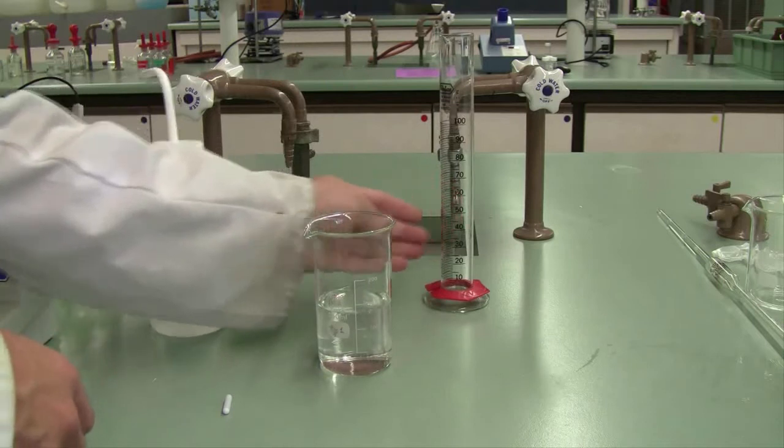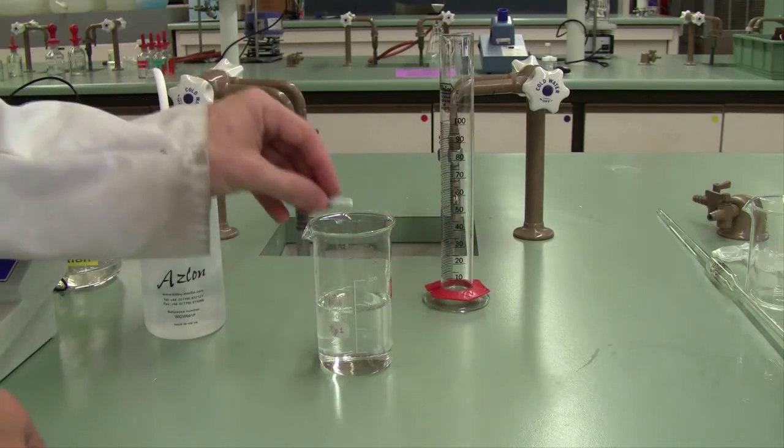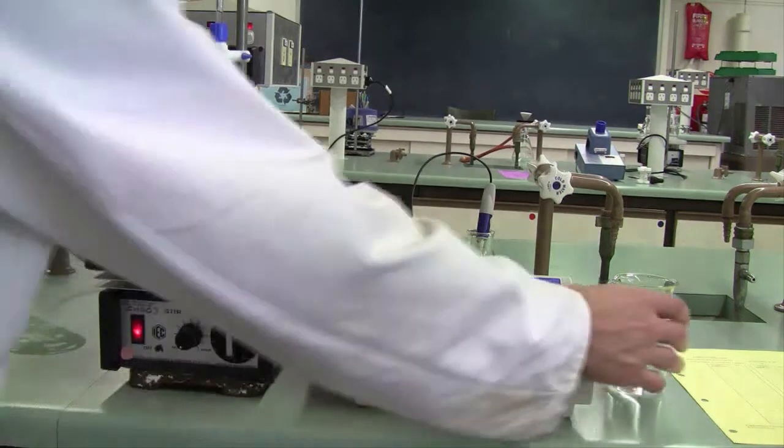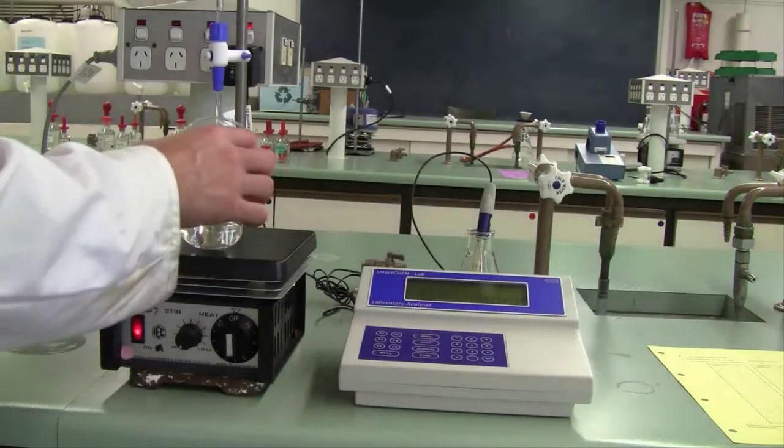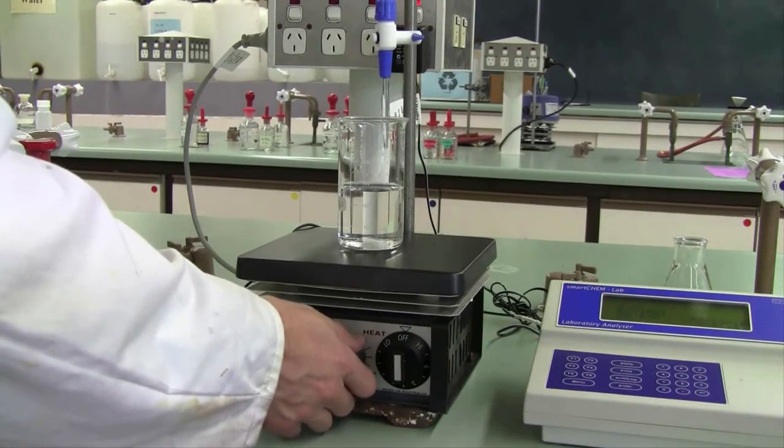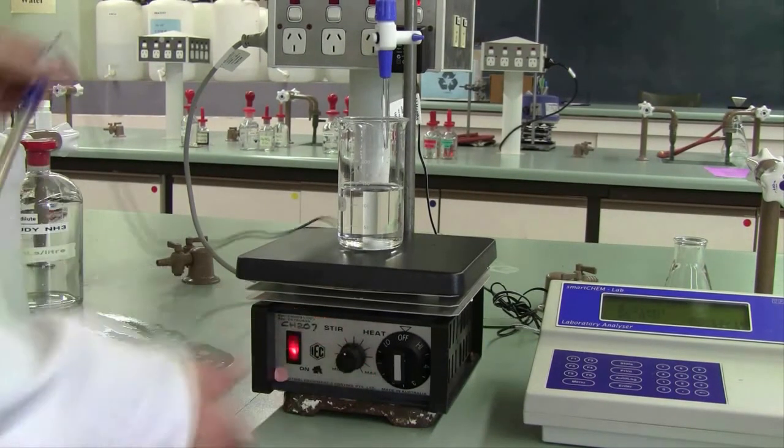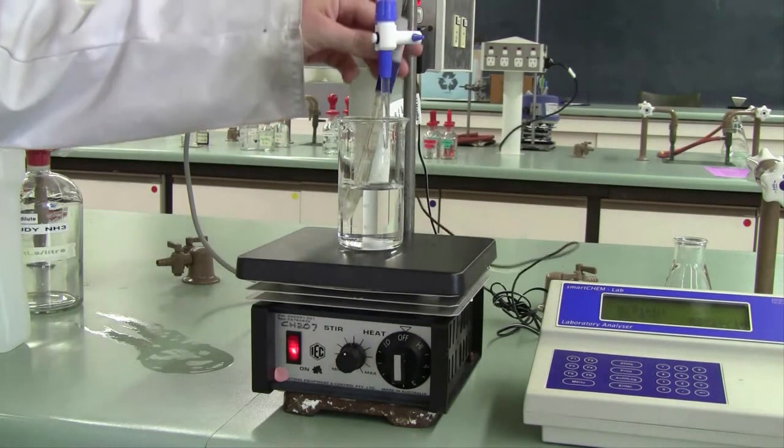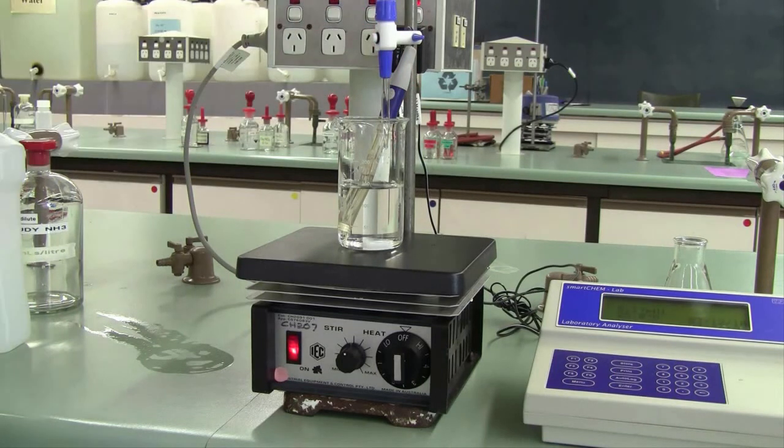Pop your magnetic stirrer bar into the solution and then complete your setup according to this picture here. Place your sample underneath the burette, turn on your stirrer, make sure it's not spinning into the side of your flask, and lastly, place your pH electrode in the solution. Make sure it's not in the path of the burette and also not in the way of the magnetic stirrer bar.